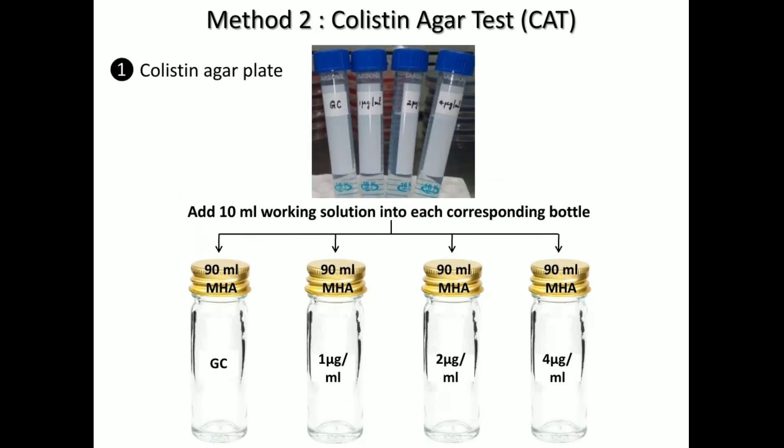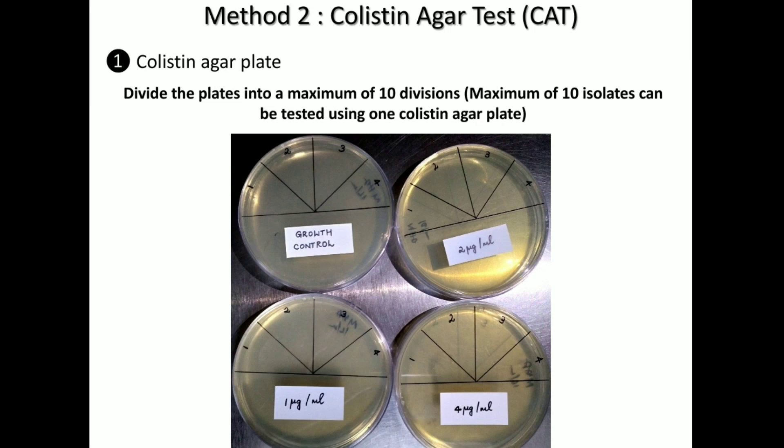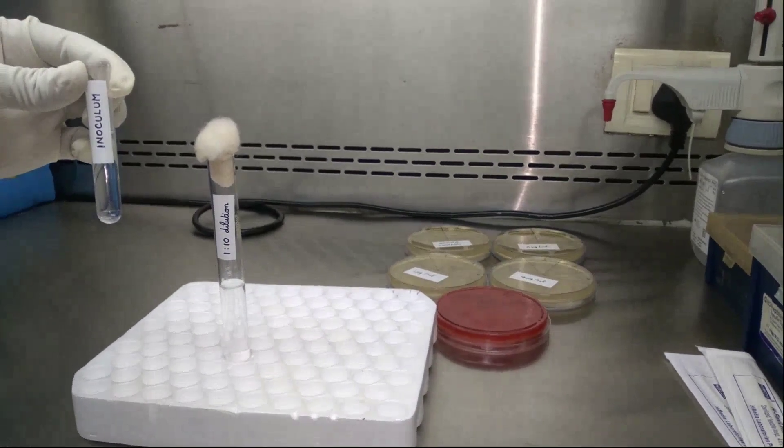Then take the working solution and add the contents of the tubes into the bottles containing 90 ml of Mueller-Hinton agar — 10 ml of working solution into bottles 2, 3, and 4. For the first bottle, add sterile saline. Mix the McCartney bottles well and pour into plates. You will finally have 4 plates: one for the growth control, one for 1 microgram per ml, one for 2 microgram per ml, and one for 4 microgram per ml.